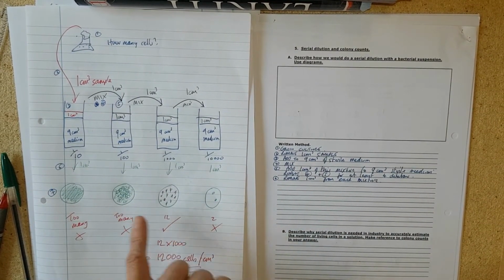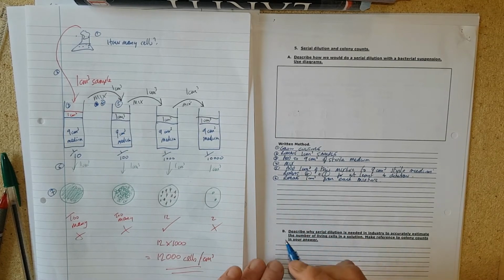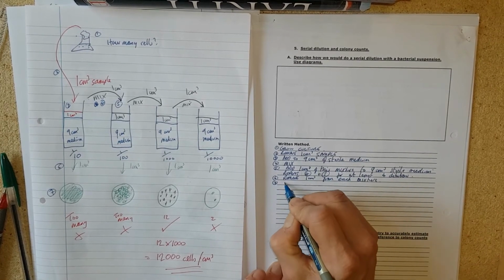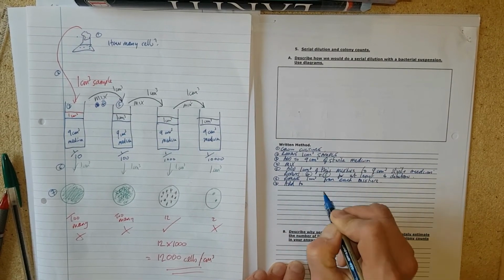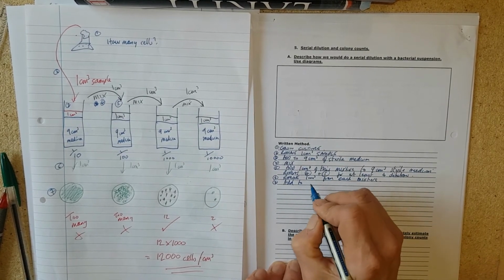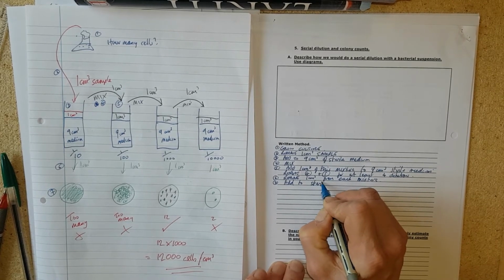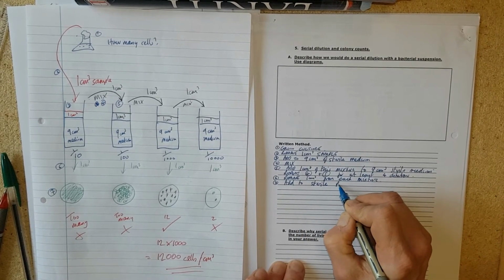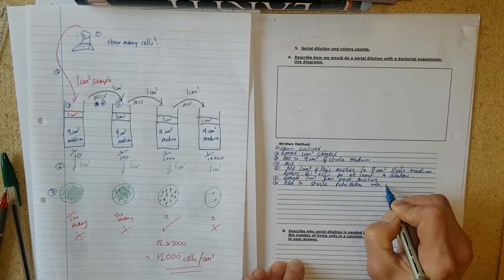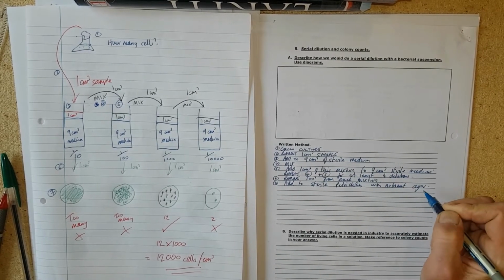And essentially what you're doing is making a lawn plate from those, but you don't know how many you're going to grow. So 7, add to 2 sterile Petri dishes with nutrient agar, or sometimes they mix it in with the agar.